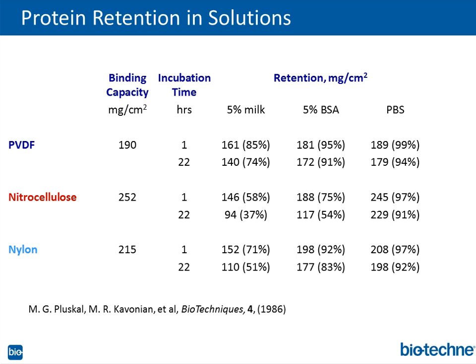And then once you've rinsed the membrane off after transfer, dry the membrane bone dry. When I say that, a lot of people will look at me in person, their eyes will get nice and big and they'll look at me like, really? And why am I saying that? It's not a necessary step. It's just a potentially preventative step because you want to get as much protein bound to that membrane as possible. So like PVDF, you can simply put it at room temperature on the bench, let it dry for a couple of hours, and then it's going to dry. And what's going to happen is, all those non-polar hydrophobic bonds are going to really firm up that bonding interaction because you're getting rid of all the water.